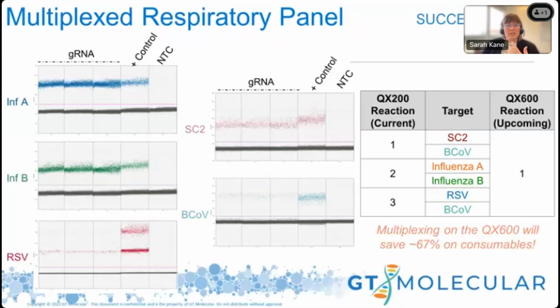Our next steps for this are to ensure that all of these targets, master mixes, and platforms are compatible with wastewater matrices, which, stemming from our other successes on the Bio-Rad platform, we don't think we'll have any issues with. So we're hoping to have a validated, commercially available assay within the next 4 to 6 weeks.